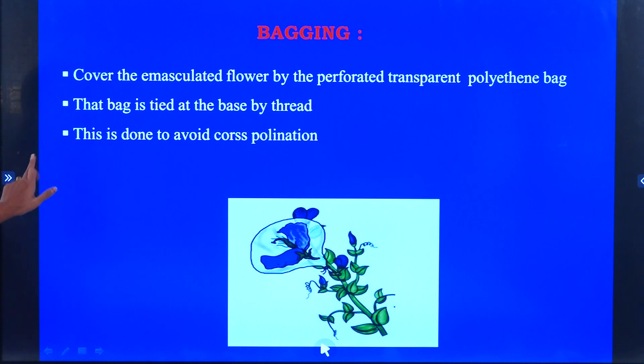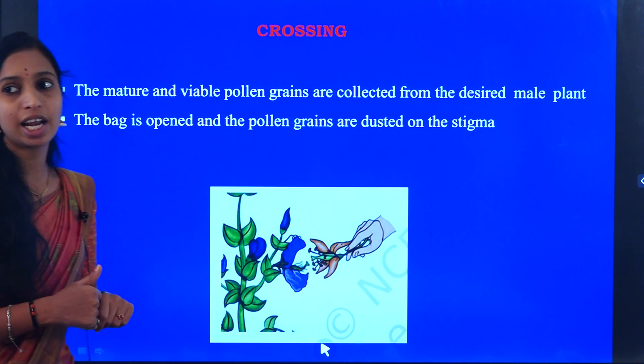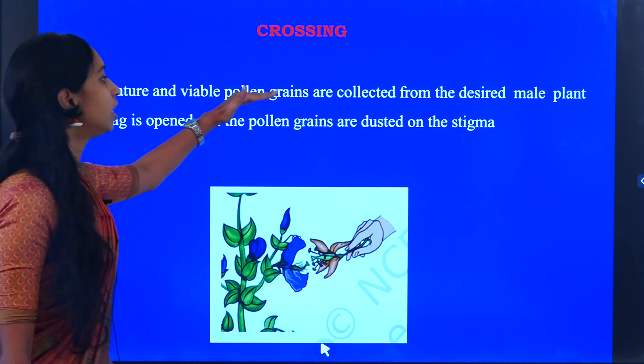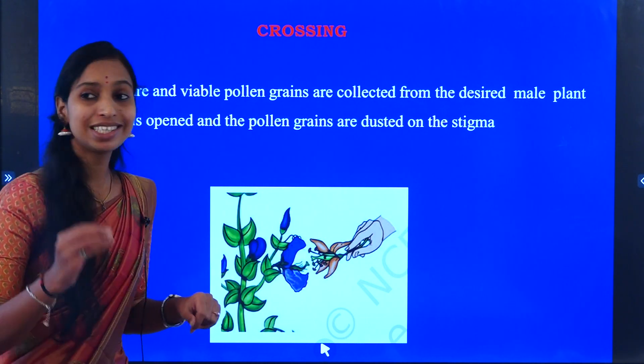The third process is crossing. The mature and viable pollen grains are collected from the desired male plant.